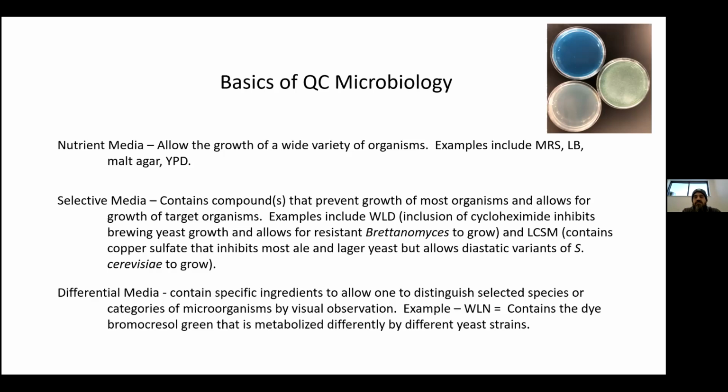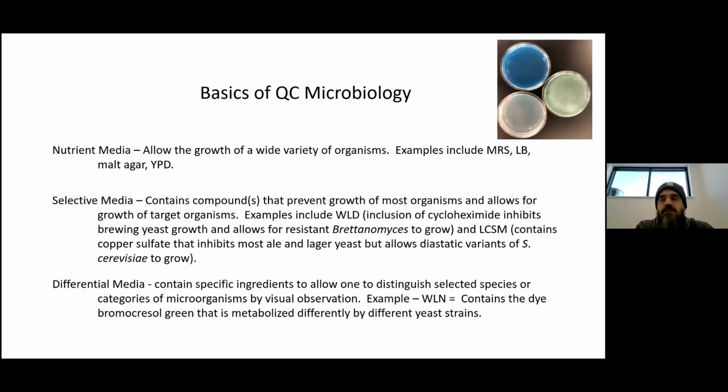Similar with, it actually allows Brettanomyces growth too. Brettanomyces yeast are resistant to cycloheximide, so that's a way for you to select for growth of Brettanomyces.